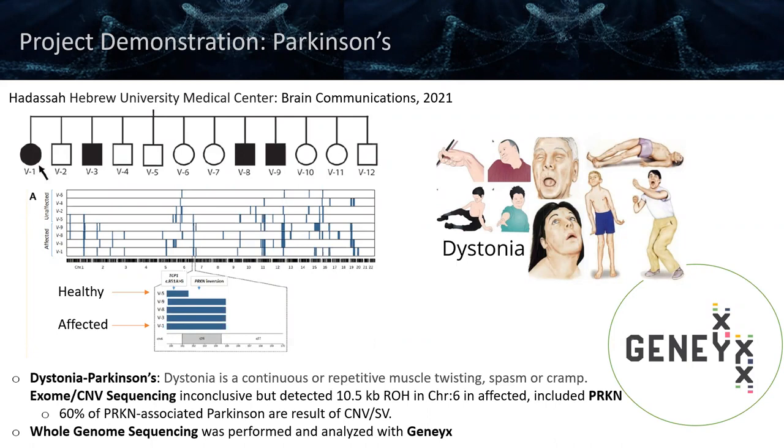Because whole exome and CNV sequencing was inconclusive, they decided to implement whole genome sequencing, and then they analyzed the output with the Geneyx Analysis platform. So in this particular workflow, we're going to be looking at a healthy and affected individual.